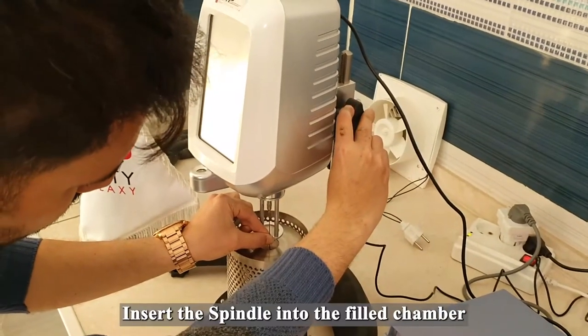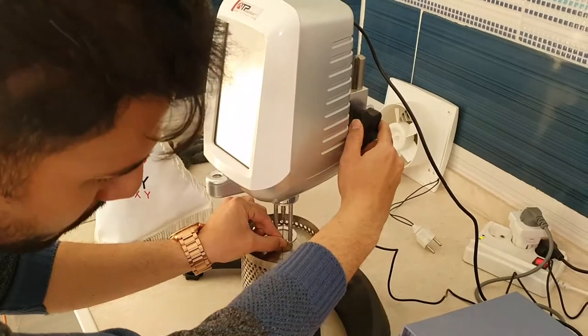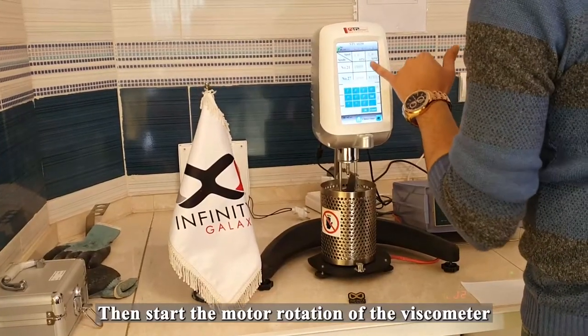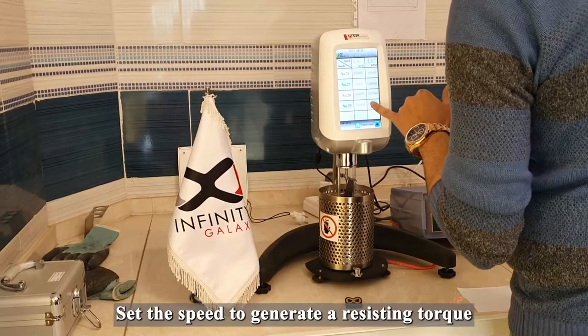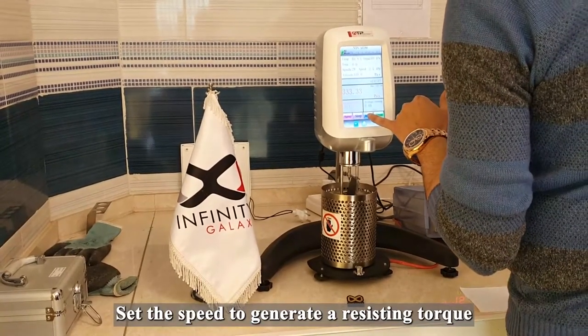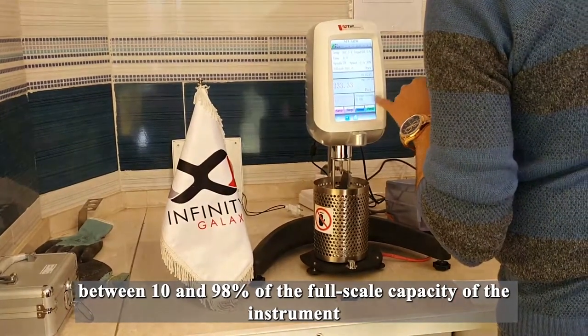Insert the spindle into the filled chamber and couple it to the viscometer. Then, start the motor rotation of the viscometer. Set the speed to generate a resisting torque between 10 and 98 percent of the full-scale capacity of the instrument.